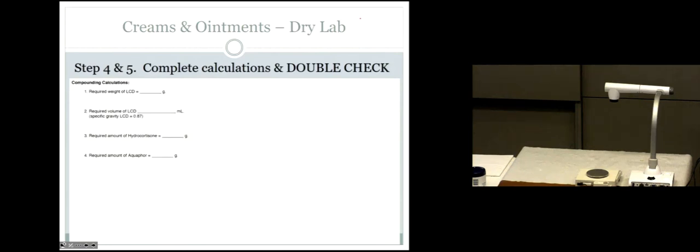So what are we going to dispense? We're going to dispense 30 grams, right? But our calculations are going to be based off of the preparation of 10% excess. Multiply that by 110%, or 1.1, to actually know what we're going to base our calculations on. So we're not going to base them on 30. What are we going to base them on? 33 grams. Remember that. Don't ever go back to 30. We are going to do all of our calculations based off of 33.